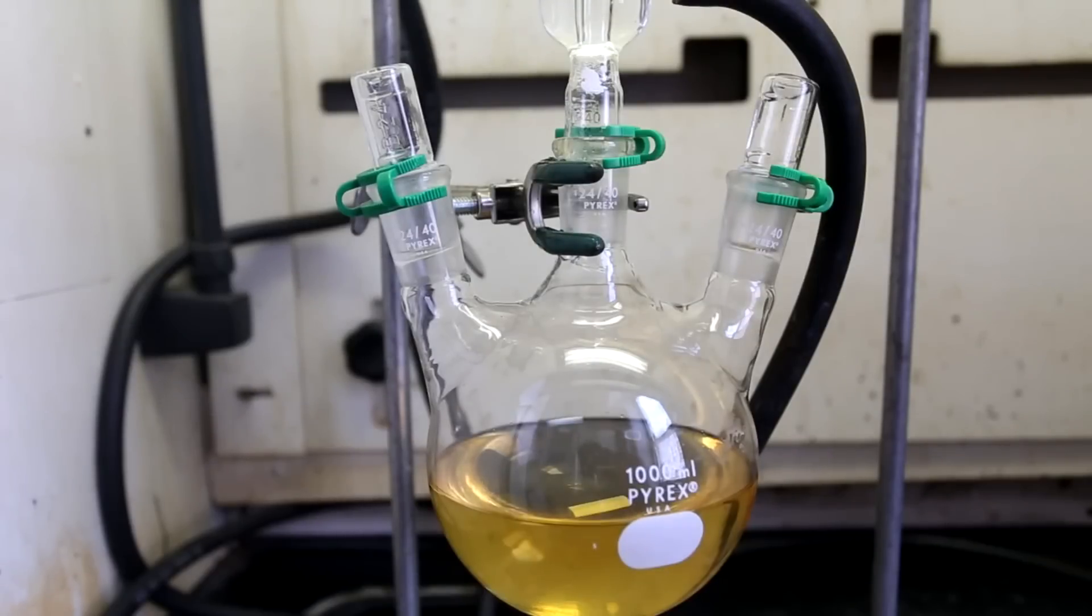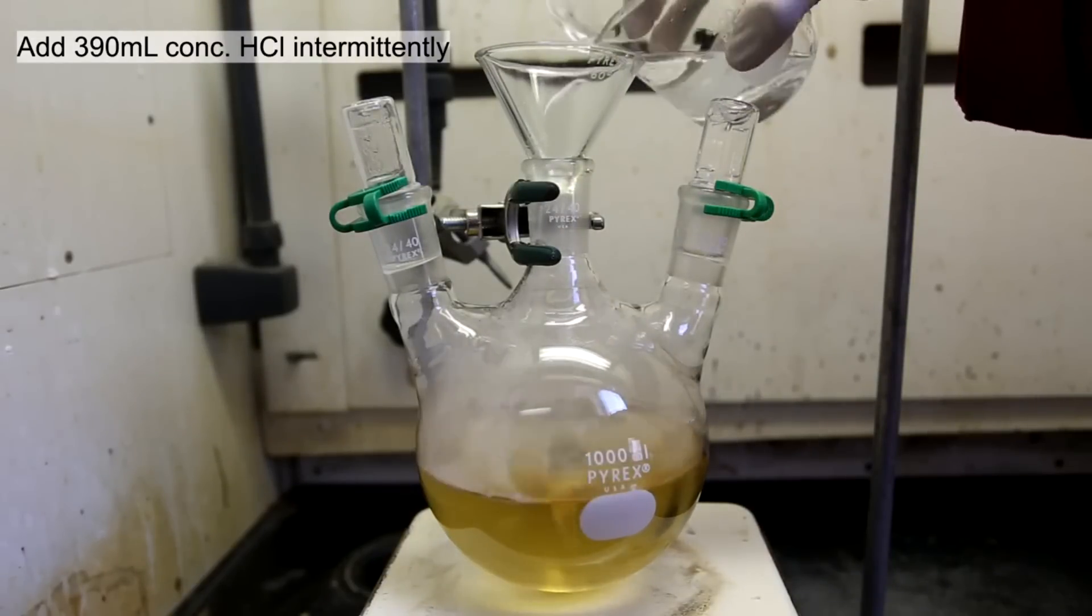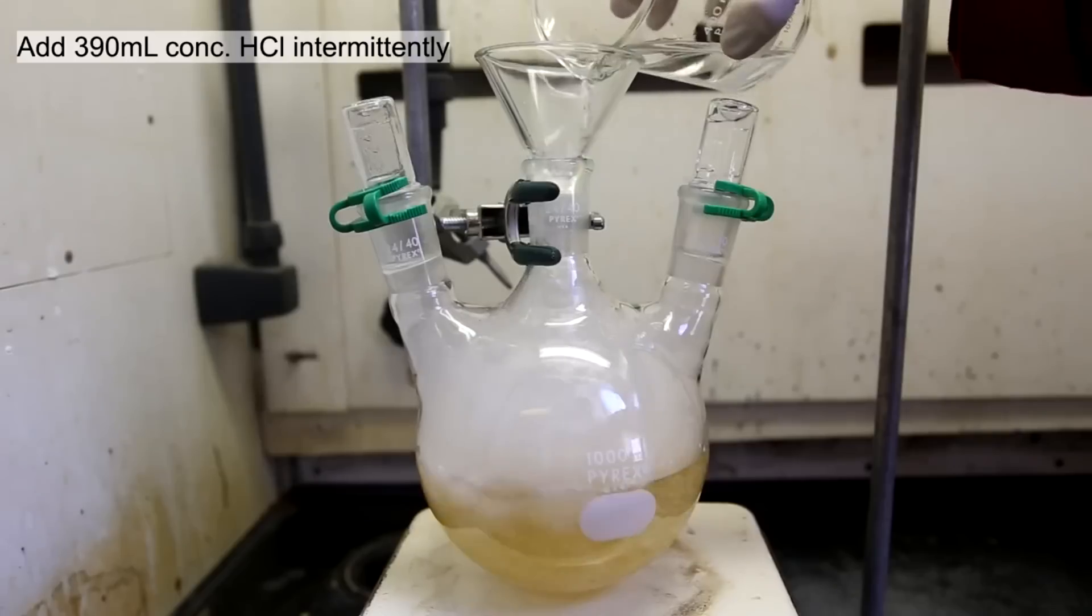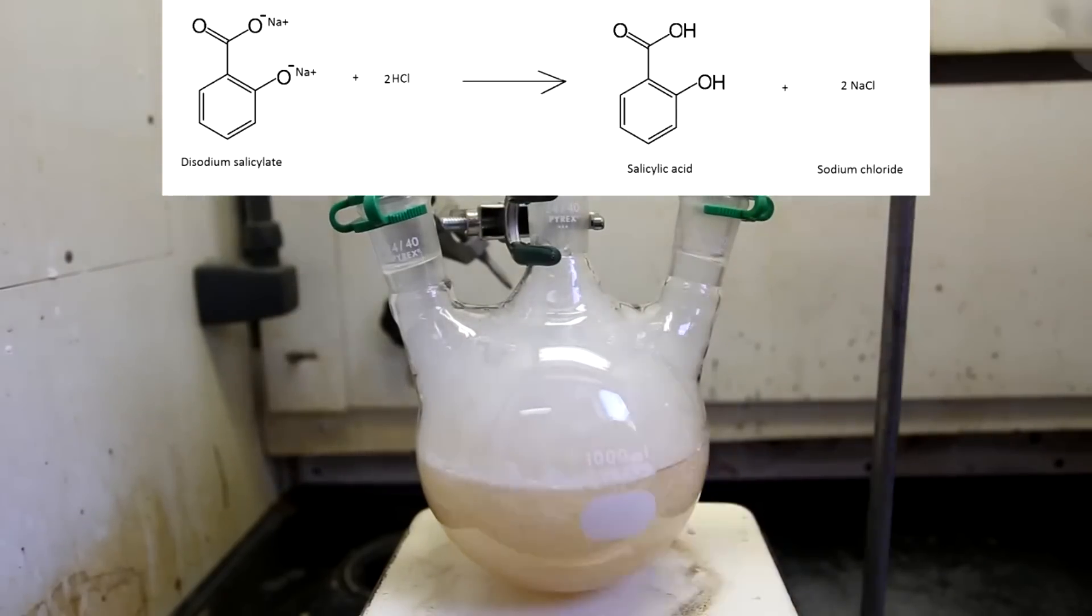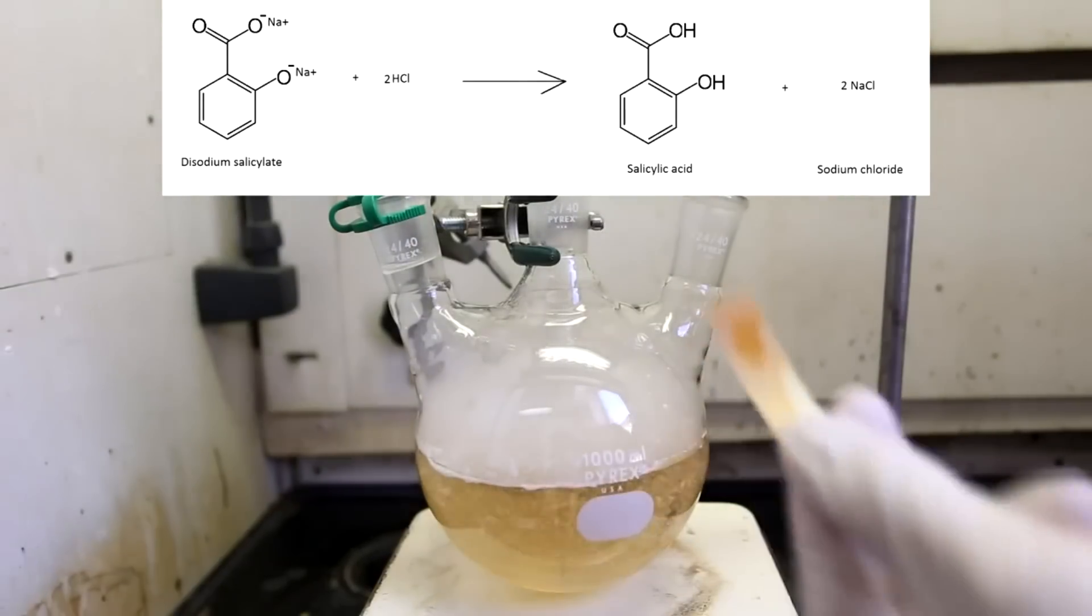After the reflux, the solution was allowed to stand and cool down until it was only warm to the touch. This basic solution was then acidified using 390 milliliters of concentrated hydrochloric acid. The hydrochloric acid neutralizes the sodium hydroxide and it regenerates the salicylic acid from its salt form, disodium salicylate.